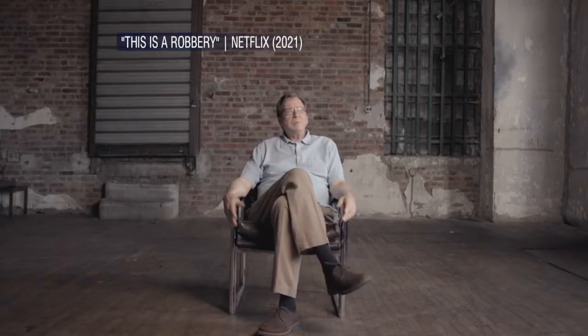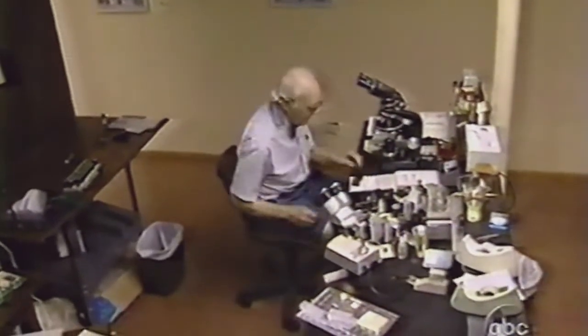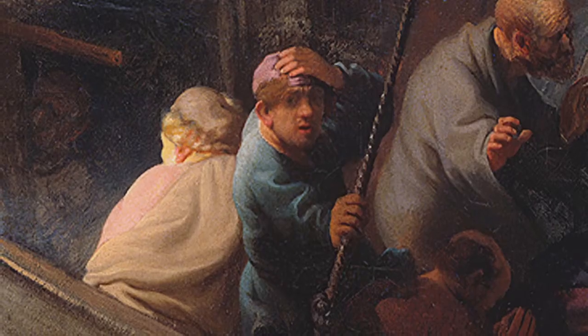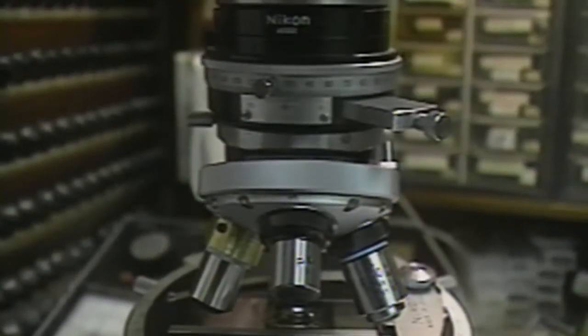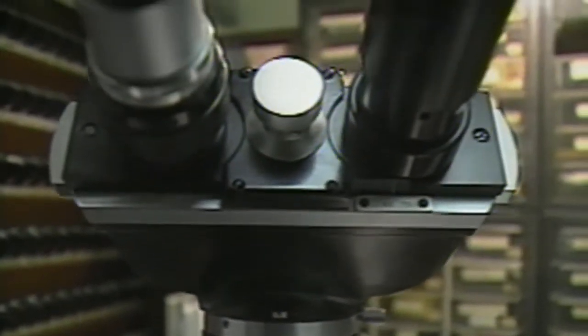But we sort of thought about paint chips. And I said, well, would it be that hard? You know, to scrape a little paint off? Walter McCrone out of Chicago had done a lot of work debunking frauds using an electron microscope. Well, not exactly. In fact, McCrone championed a somewhat simpler but no less powerful tool, the polarized light microscope, as he told WTTW's The New Explorers in 1990.